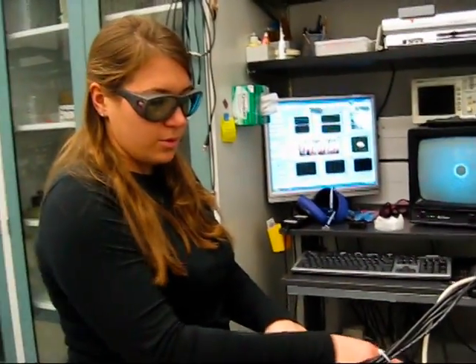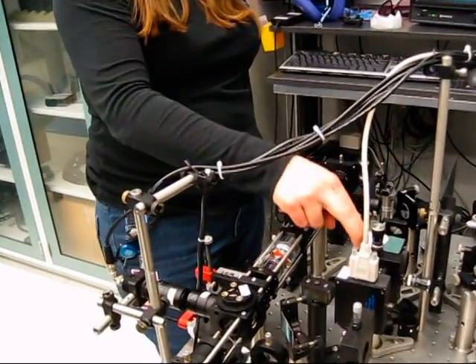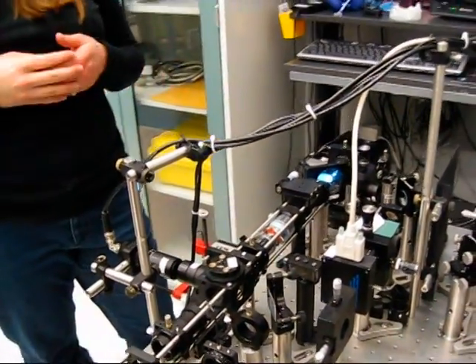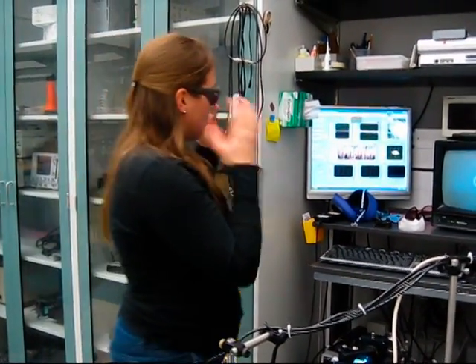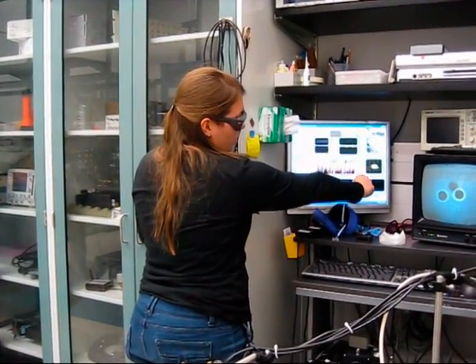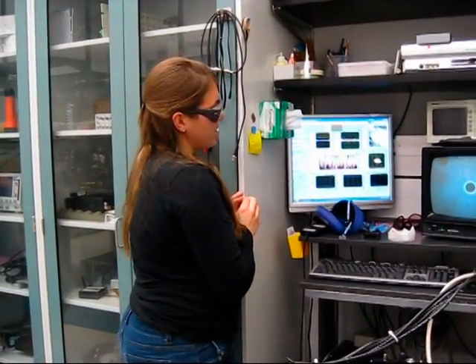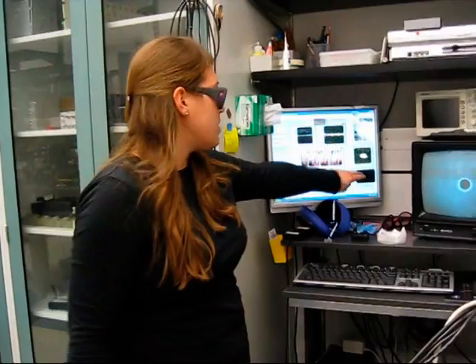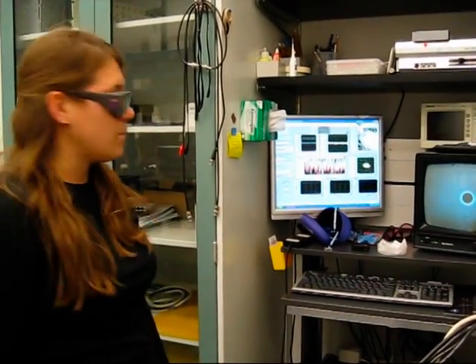The forward-scattered laser light is collected and projected onto this position-sensing diode. The voltages that we read from the position-sensing diode give us two voltages: one proportional to the position in the x direction, and one proportional to the position in the y direction. So we track these two signals in time — that's the red and white line here. We plot the y and x signals on one plot so we can see the actual signal in real time, and we plot a power spectrum for each dimension below so we can watch how strongly the particles are trapped while we're taking data.